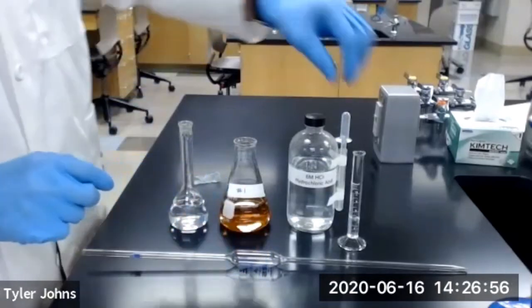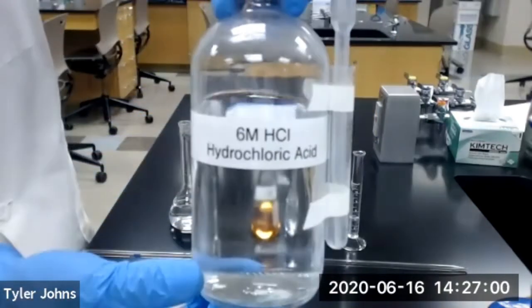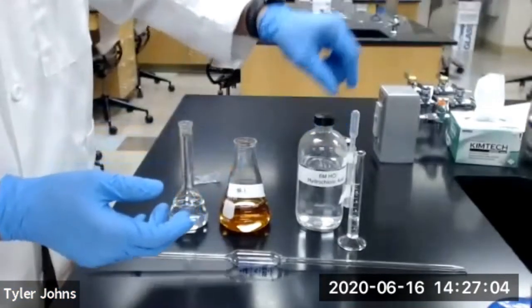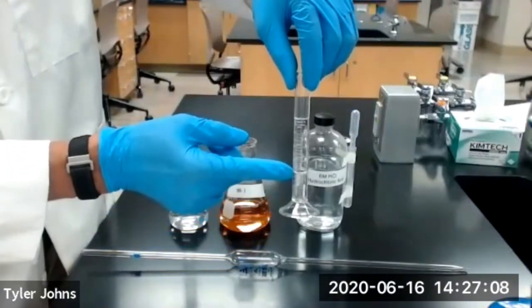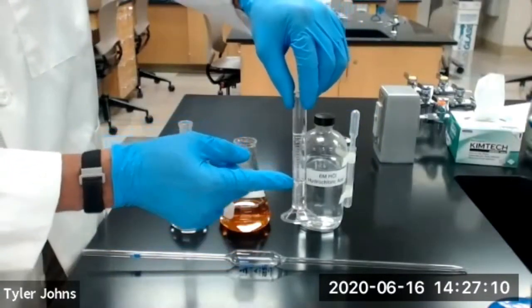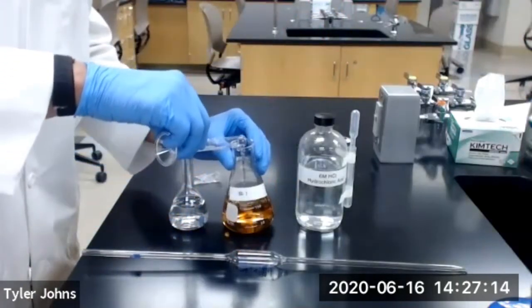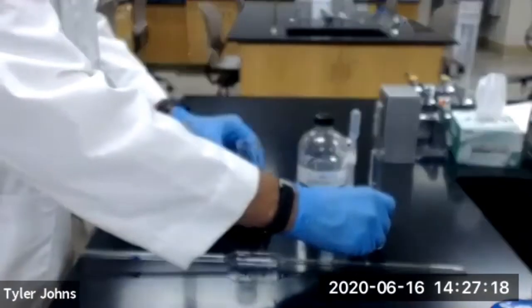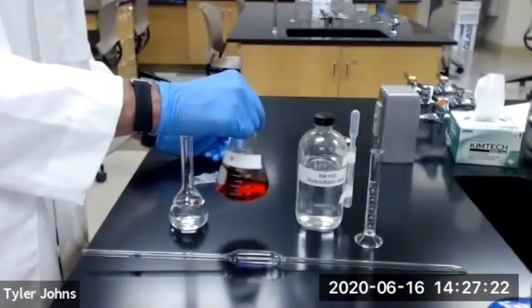We are also going to add 4 milliliters of 6 molar hydrochloric acid using a 10 milliliter graduated cylinder. I've already gone ahead and added the 4 milliliters of hydrochloric acid. And this will also be transferred to Erlenmeyer flask number 1. We will then swirl the flask to mix.